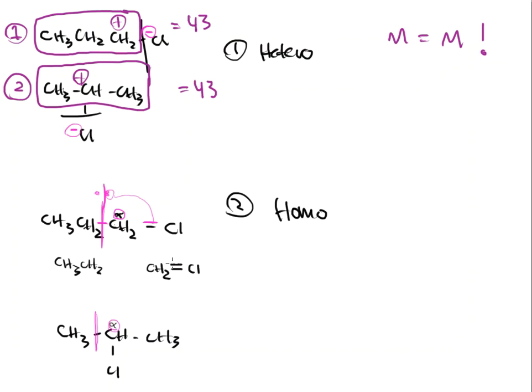And that extra bond has come from those electrons that it has sandwiched and gathered and pulled in to the picture. All right. With that said, this chlorine now has overextended itself, and this guy becomes positive. And this is the positive fragment that gets seen by the mass spectrometer. Same thing's going to happen down here at the bottom.